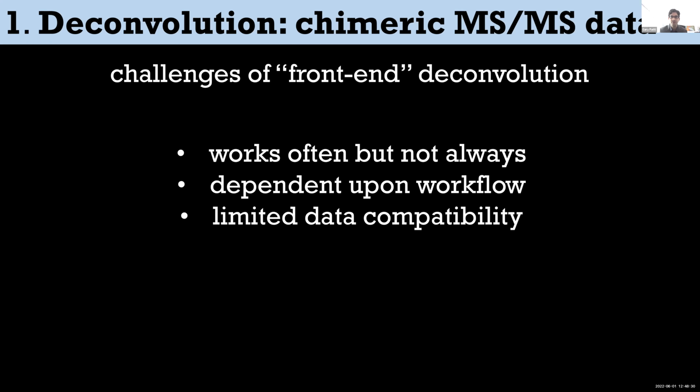Furthermore, if we think about the environment where we are trying to share data, using public datasets, for example, in the Metabolomics Workbench, they most likely weren't performed with this kind of workflow, with sliding MSMS windows or getting a lot of MSMS data to try to do deconvolution across an entire chromatographic peak. Or maybe they don't have a good enough chromatographic separation to do these sorts of experiments.